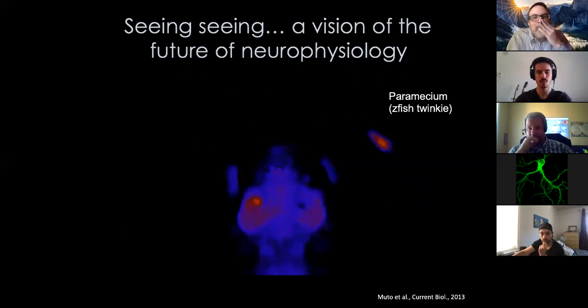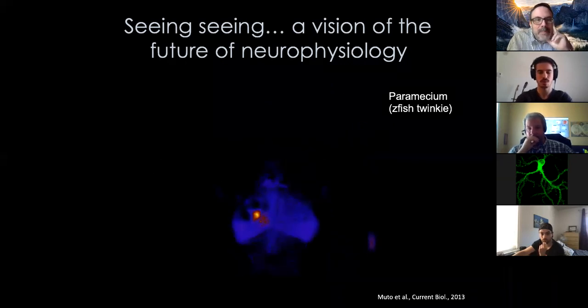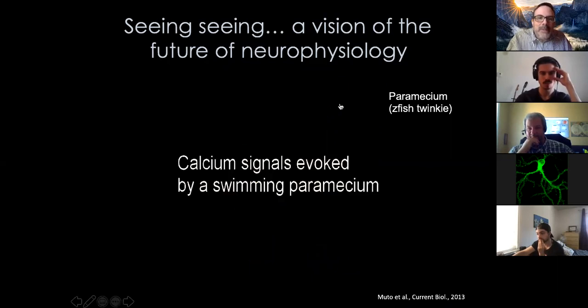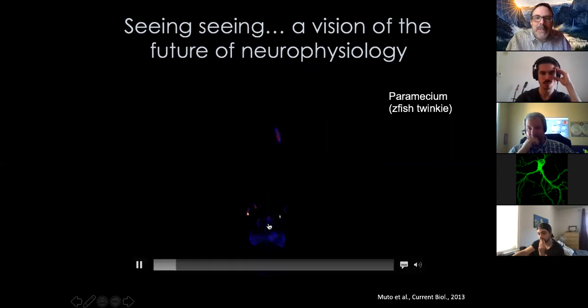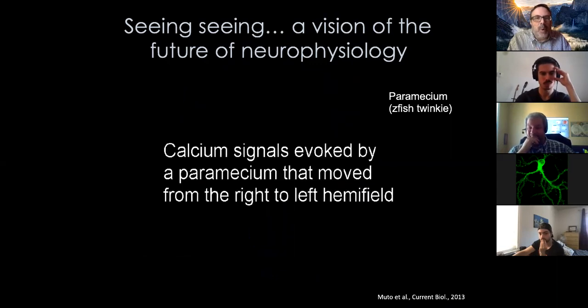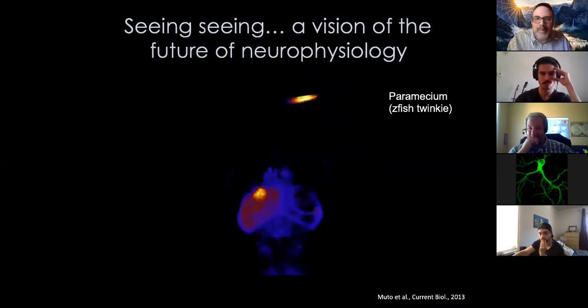This is from Muto et al. from Japan. This is the group that developed GCaMP7, but this is an earlier version of GCaMP7. And it's quite amazing that you can actually make out in the optic tectum, if I go back and play this again. So this is a paramecium, which is what zebrafish like to eat, as you guys probably know. And if you take the GCaMP expressing animal, this is the optic tectum here. You can actually see the representation of that paramecium in the brain of the animal in real time. It's super cool. I mean, you're watching this animal watching the prey.